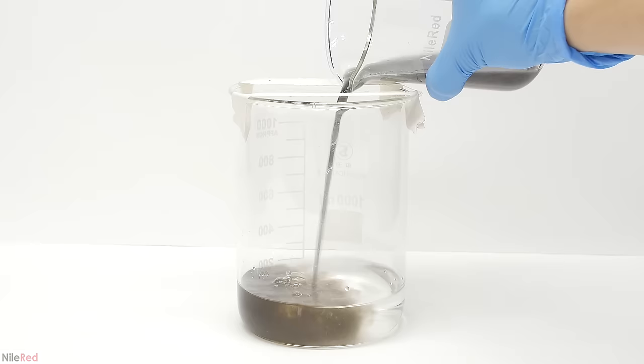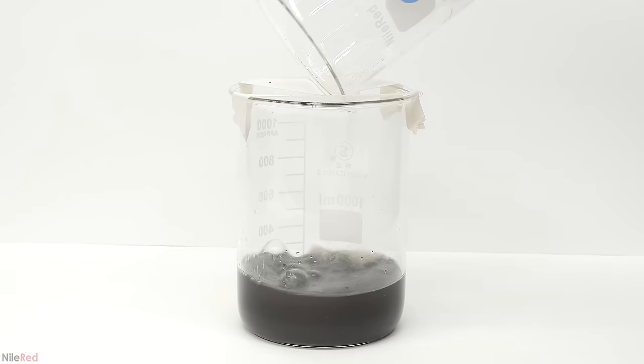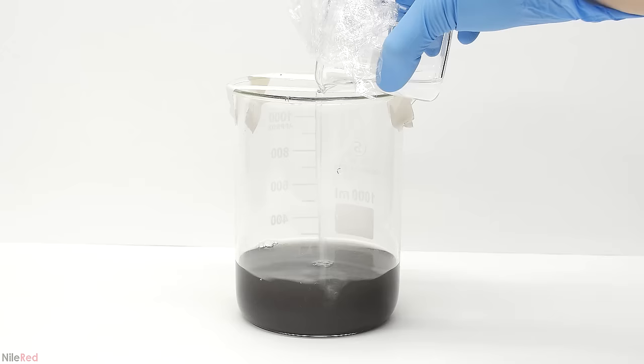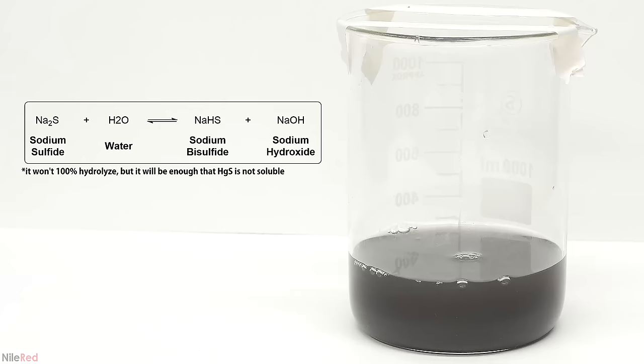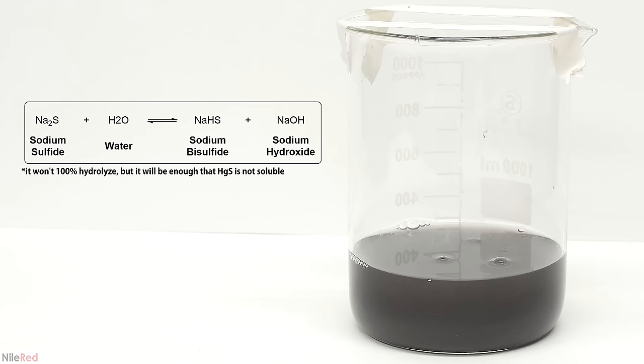Then into this solution I added the contents of our other waste beaker. The beaker was washed a few times to make sure I transferred everything. The reason I did this is that the other solution still had some sodium sulfide in it, so it made sense to just combine the two and not waste any of it. I ended up adding a little bit more sodium sulfide just for good measure to make sure all of the mercury was removed. I then left this overnight for all of the sodium sulfide to be hydrolyzed to sodium bisulfide. Mercury sulfide can be soluble in sodium sulfide solutions, so this is just a precaution.